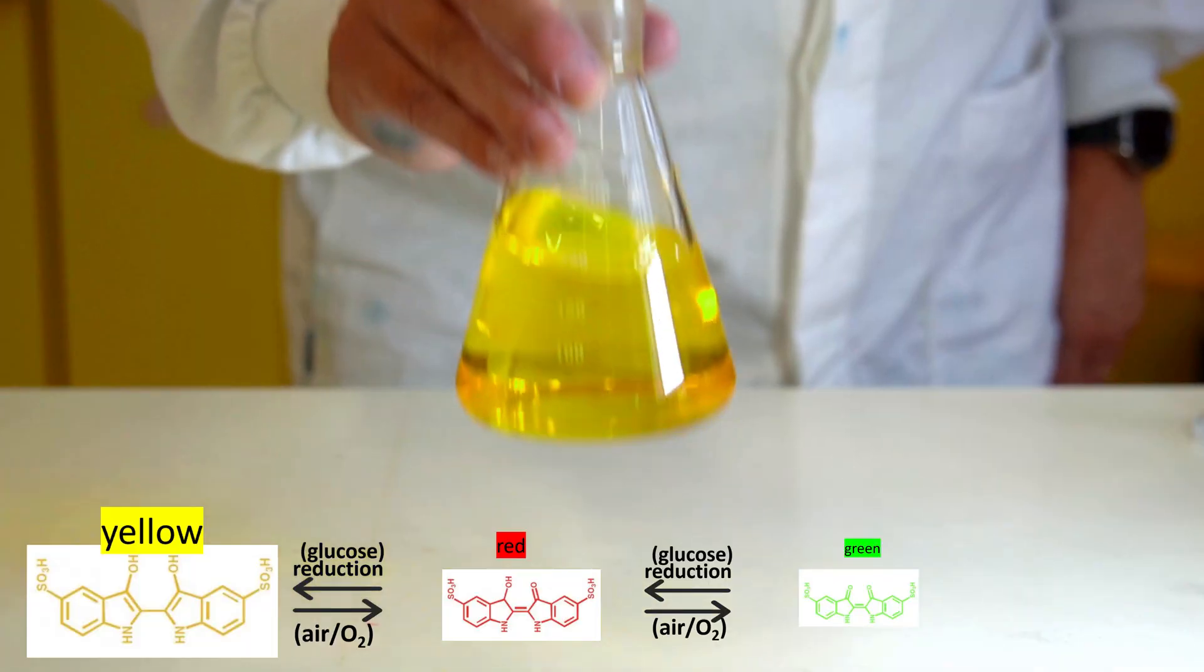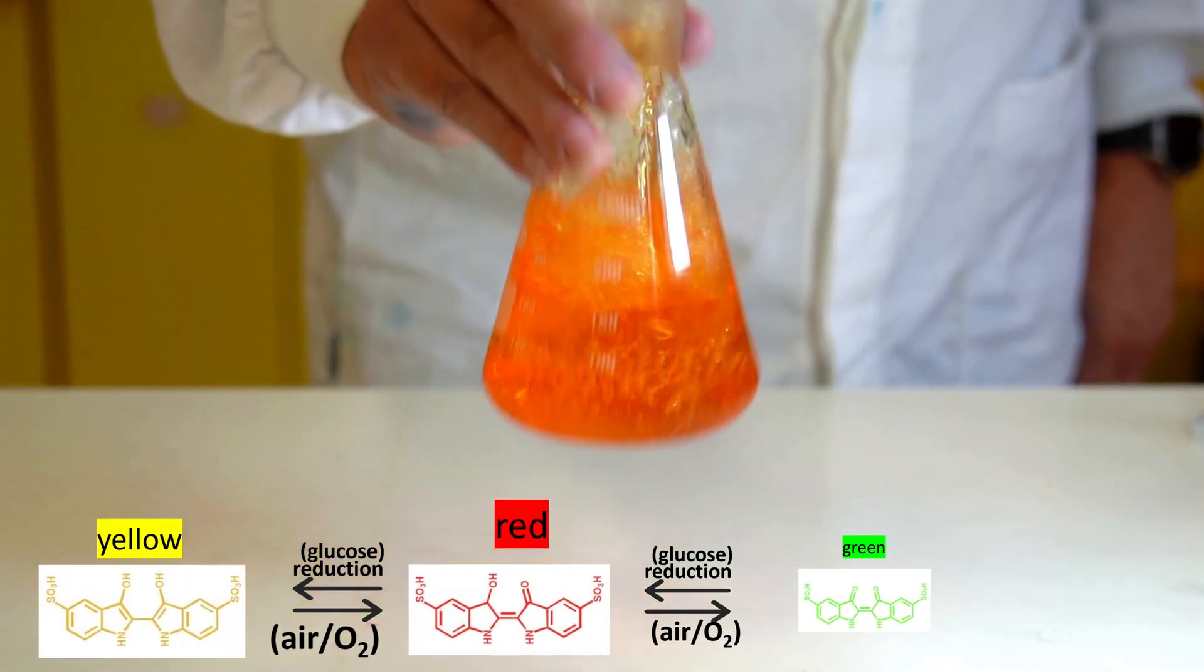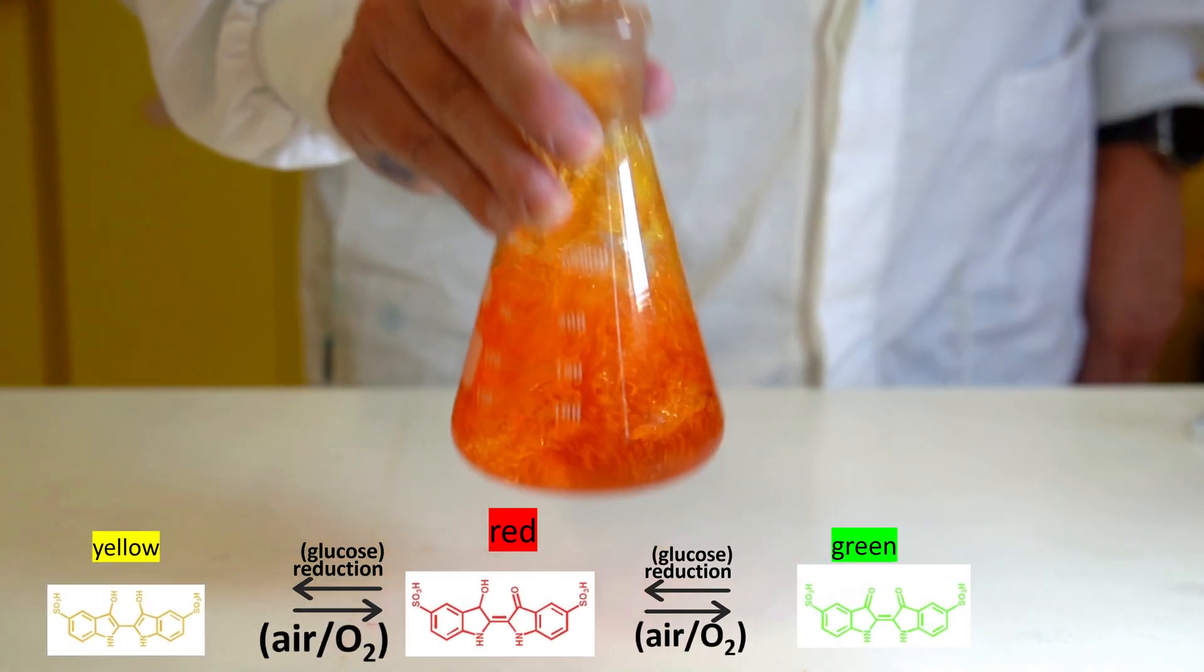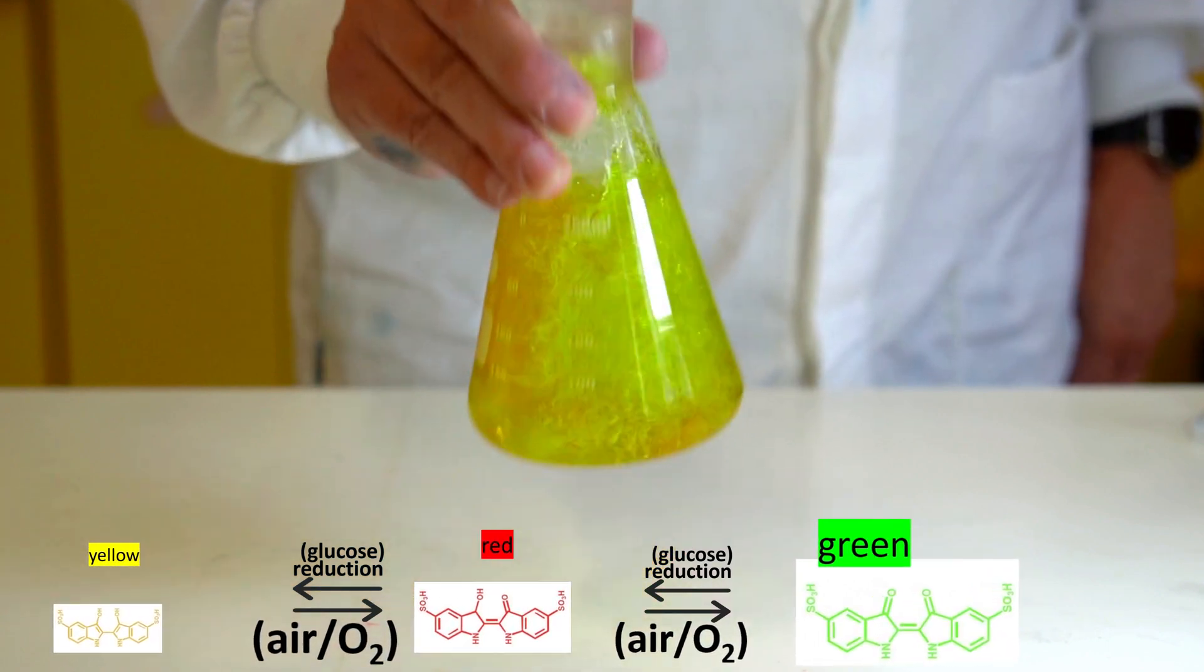Shaking introduces new oxygen molecules in the reaction, favoring equilibrium shift to the red indicator form. Vigorous shaking adds more oxygen and equilibrium shifts even more to the green indicator form.